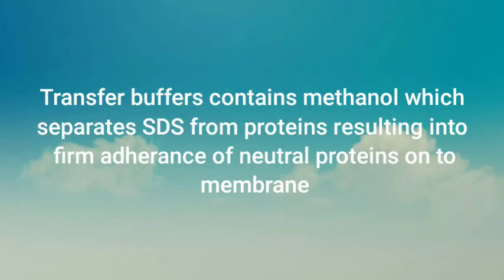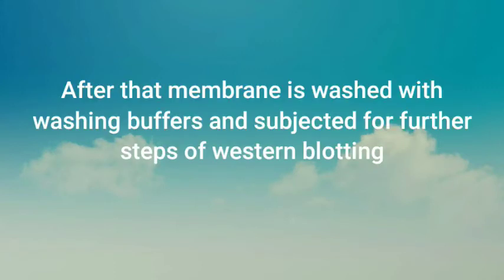Transfer buffer contains methanol, which separates SDS from the proteins, resulting in neutral charges on the proteins, which adhere onto the membrane firmly. After that, the membrane is washed with washing buffers and subjected to further steps of Western blotting.